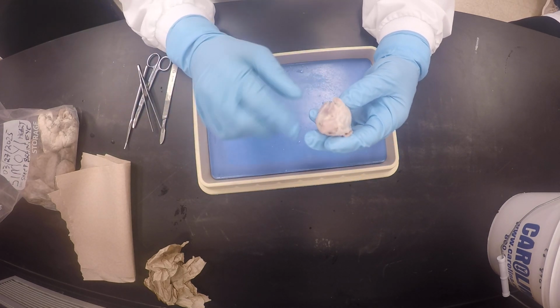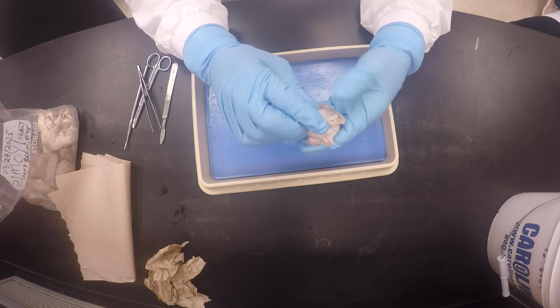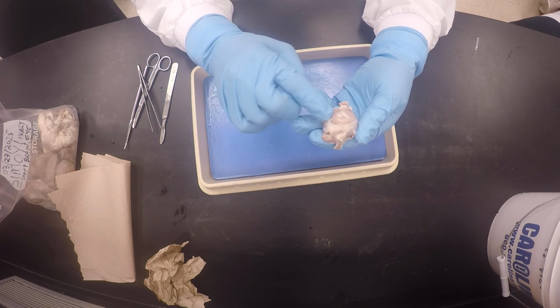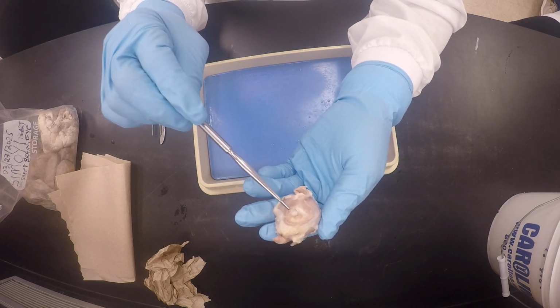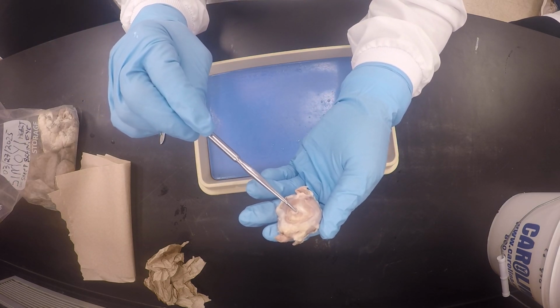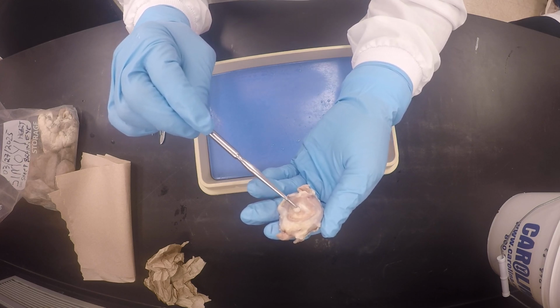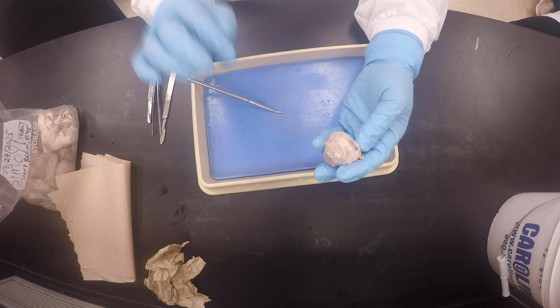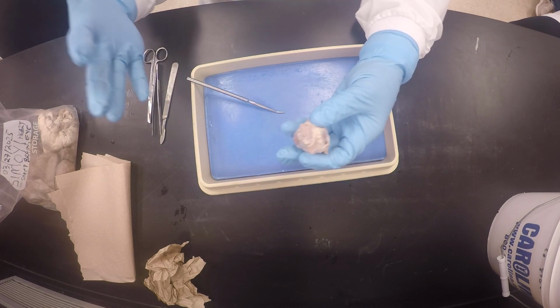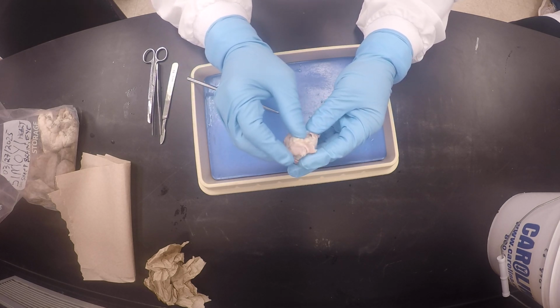And then, because this is ruminant, you got it right at the back, you see that retractor bulbi, and then you could see right here, this is optic cranial nerve number 2. Do you see this? And there's the retractor bulbi, and then you are done. So we have identified all the 7 extrinsic eye muscles. The human obviously doesn't have the retractor bulbi.